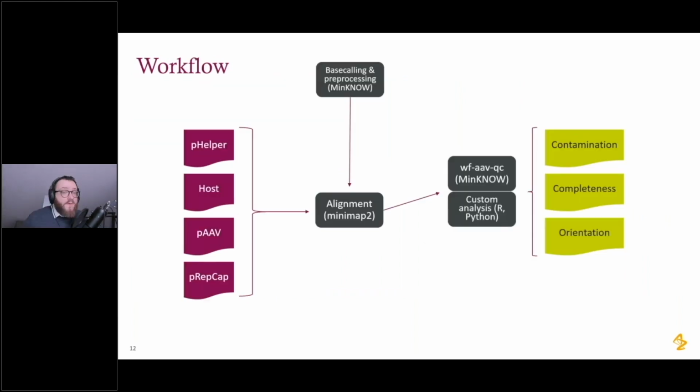Our workflow combines the public epi2me workflow from Oxford Nanopore. On top of this, we have created some of our own custom tooling, some of our own custom scripts that work either with the output or in concert. I should note that we use the standalone version of the workflow. You can use this through Nextflow, but since we run most of our analysis on high-performance compute clusters, we typically just get the workflow itself and run it on the cluster.